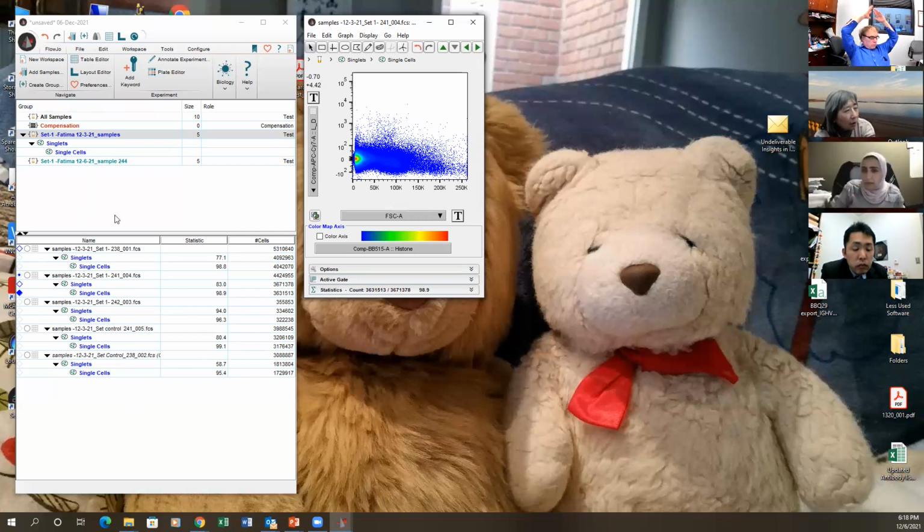You can drag it the way it's set up here. You drag this out to the other sample. Whatever gating I set here, you drag it over there, it will be the same gating. So even though you don't run it at the same time, you analyze them with identical conditions. Those are the ways to overcome that. How you set this up is less critical. The more critical thing is whether you run them with the setup and gating identical.